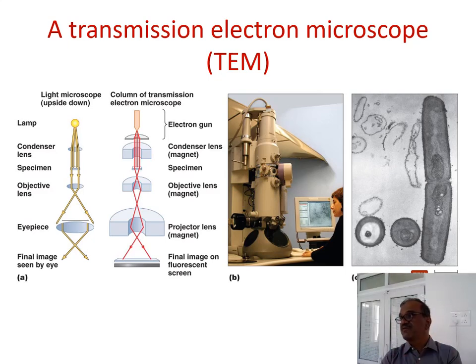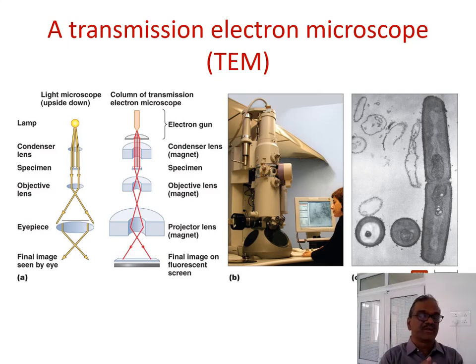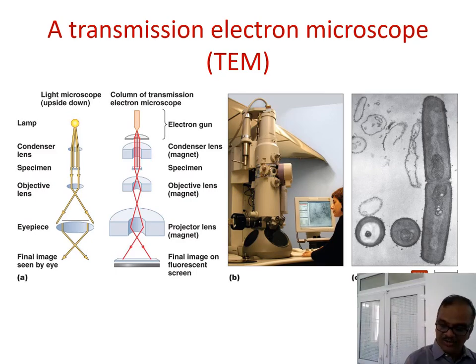For most viruses, they use the transmission electron microscope to observe various characters, and it also gives the composition of the particular head capsule, whether DNA, RNA, or proteins. Everything can be attached to another apparatus, and then you can see how best you can observe it.